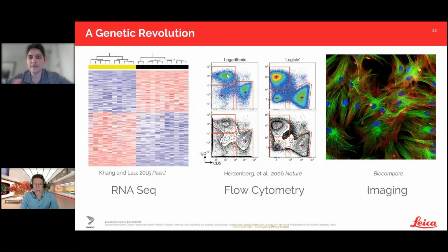But how did we get here historically, where people would be asking that kind of question? CellDive is an attempt to thread the needle between two divergent technologies, one of which would be omics technologies, and the other would be imaging technologies. And the benefit to an omics style technology like RNA-seq is that you get very complete information about the expression of different genes in populations of cells. You can learn every RNA that's being expressed in a population of cells.